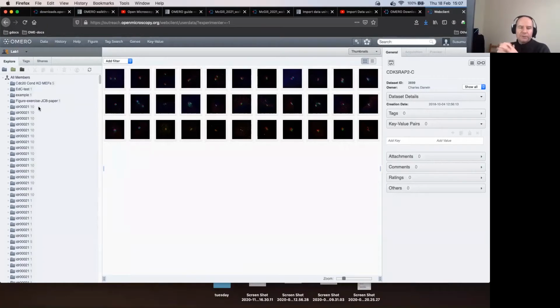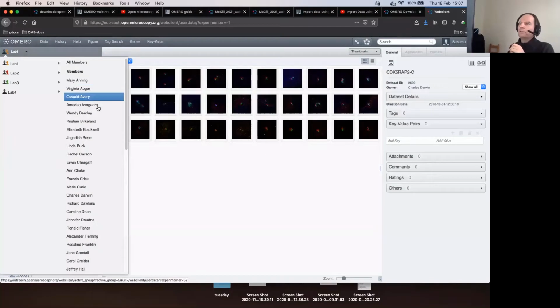So a command could be passed saying pass the objects of person A to person B in their entirety, or pass object X of person A to person B. The ownership will change in such a case, and then the appropriate drop-down menus will respect that.